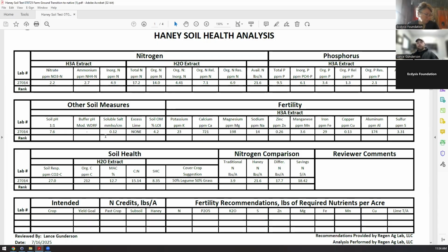Sulfate will grab onto sodium and that can help lower sodium in sodic soils. But a lot of the free sulfate, because it's soluble, makes your soluble salt number go up. So I will give you a real world example of this and how it affects the numbers on this test.